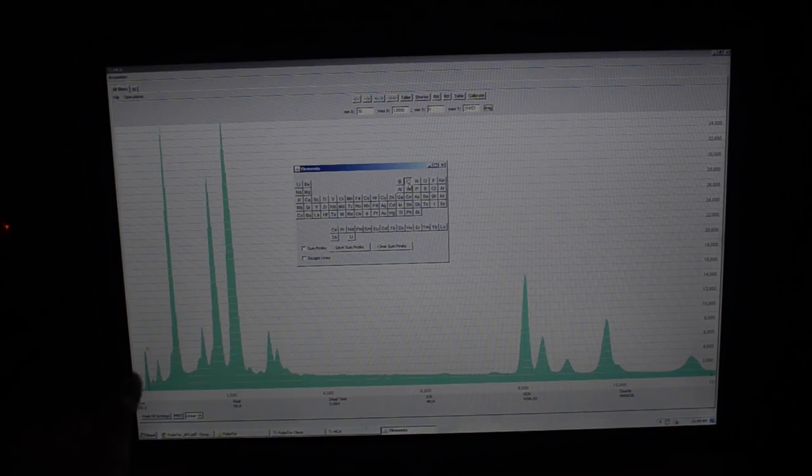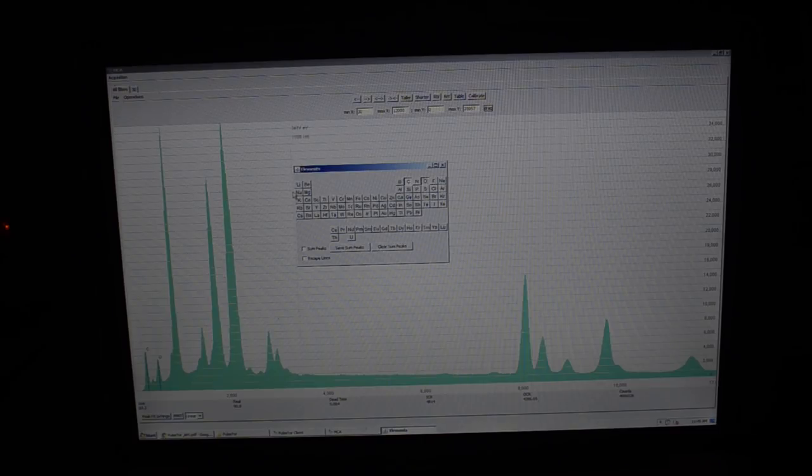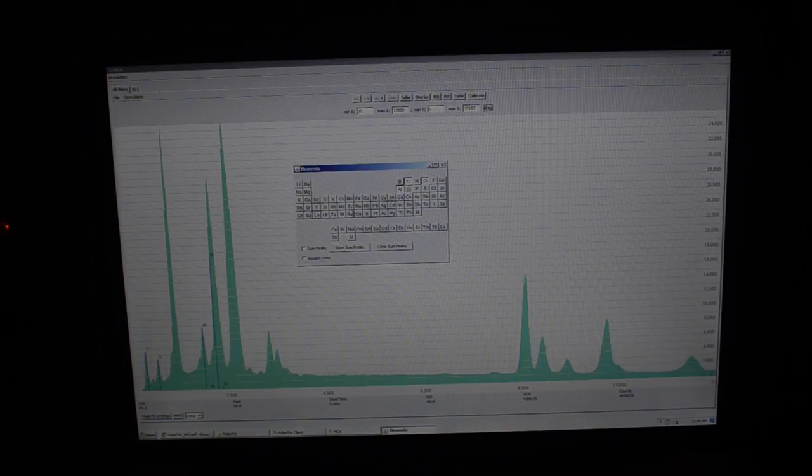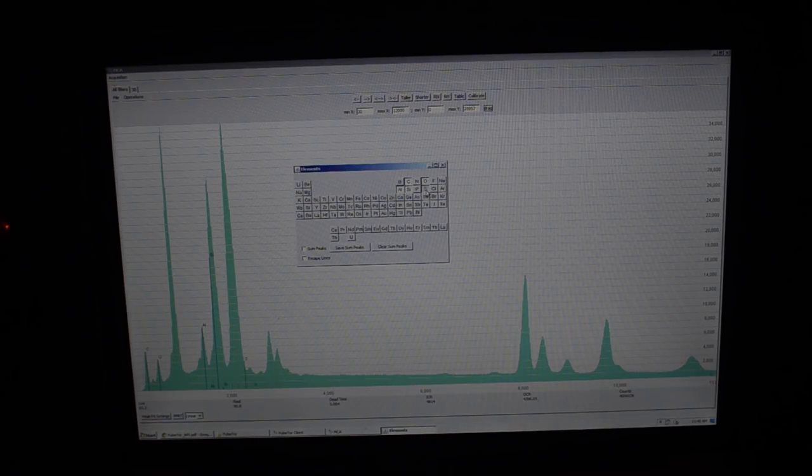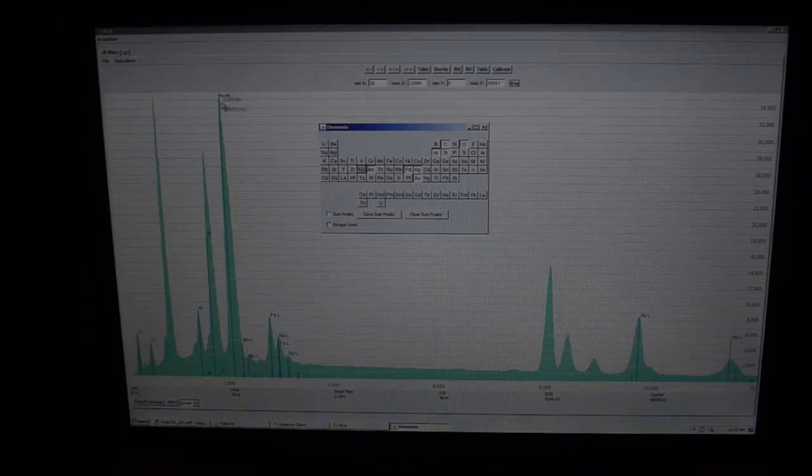I know we'll have some carbon, and that's right there. Maybe a little nitrogen peak there. We'll have oxygen in our sample. I wouldn't expect much here. Not much there. We'll have aluminum for sure. Silicon. There's actually two peaks here. We can't differentiate between them, but there's some silicon that's from the detector itself. I think I've identified most of these. We have some gold. There's some silver, like I was talking about. That's in the silver paint that's holding things down. I'm going to save the spectrum. I can look at it more later.